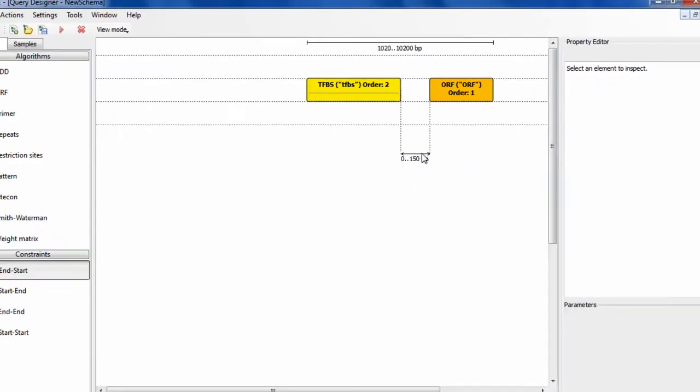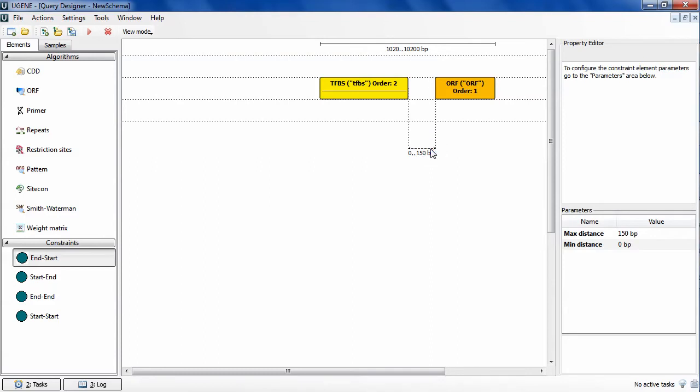When I select a constraint element by clicking on it, I can see its parameters values in the property editor, just like I did with an algorithm element.